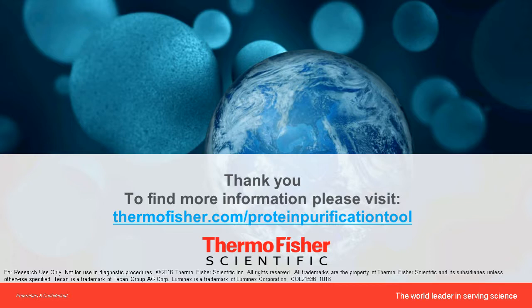So it's actually compatible with the in-solution digestions after IP. However, it depends on what you use for in-solution digestions. We are using 6-molar urea, which you have to do the cleanup afterward. And typically we do online C18 trap cleanup, but you can actually use also offline zip tip or stage tip to clean up the peptide before you run on a mass spec.